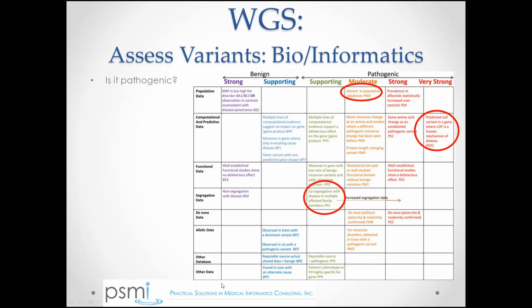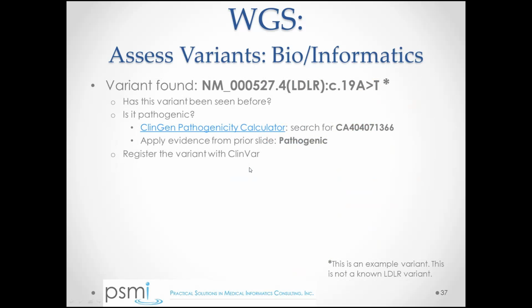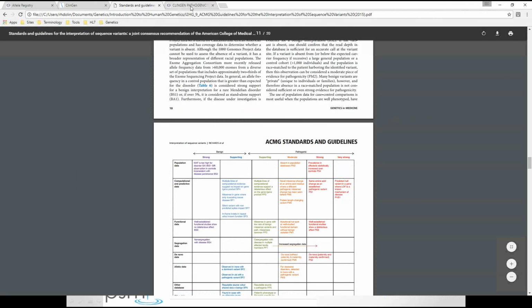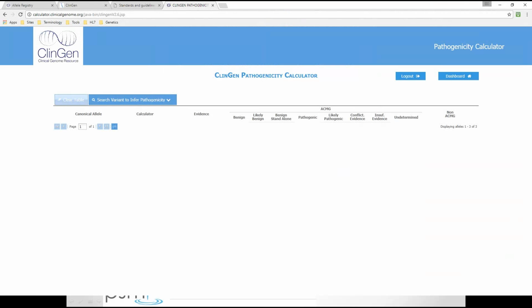So the main pieces of evidence we have in our case in determining pathogenicity are the ones circled here, and we can now plug this in to our clinical pathogenicity calculator. Let's just do that, because it's kind of groovy to see what happens.